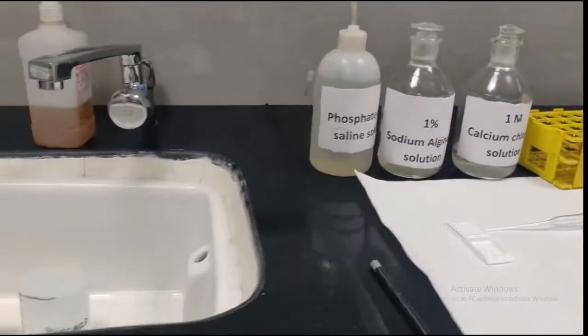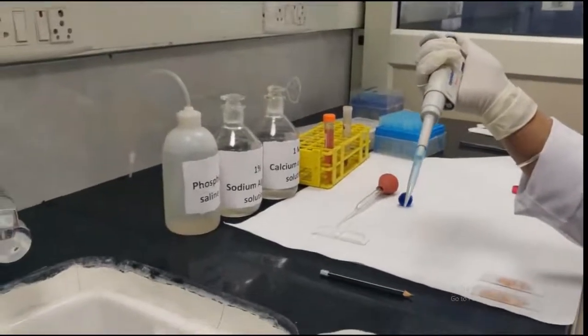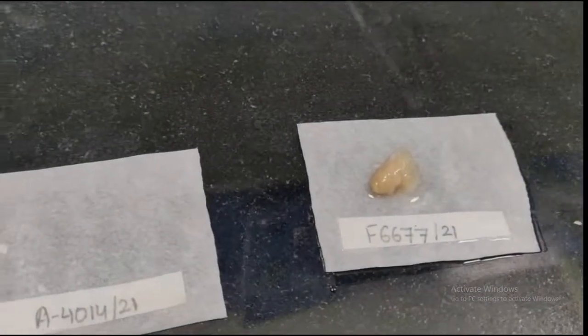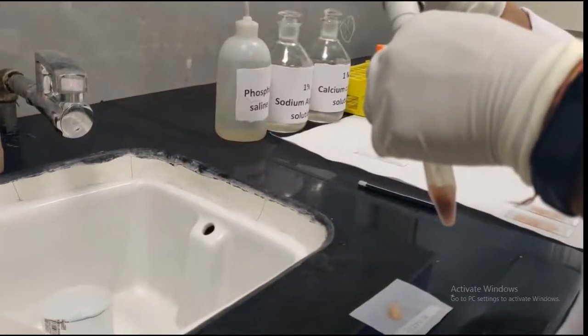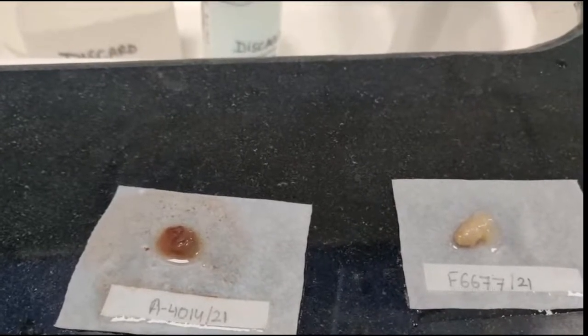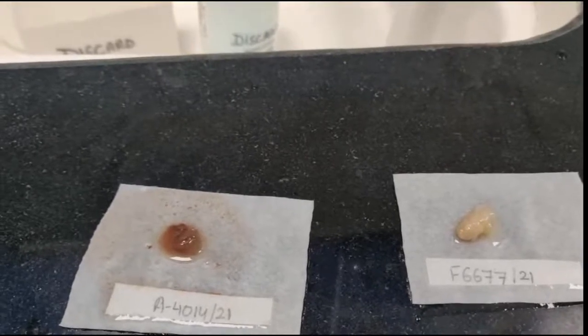So now we will take out these gels on these filter papers that have been labeled with the sample IDs. We will gently take out this gel onto the filter paper. You can see our sample, our cell sediment, is entrapped within this gel. This will be done for the second sample now. So gently we will be taking it out. So these are both the cell blocks that have been entrapped within the gels, the sodium alginate calcium chloride gel.